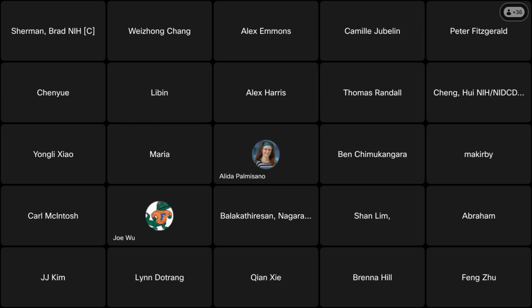Great, thanks. The second question is whether the fold enrichment in the functional annotation and enrichment is compared to background. They're referring to the functional annotation chart. Okay, perfect. Yes, that's exactly what it is.